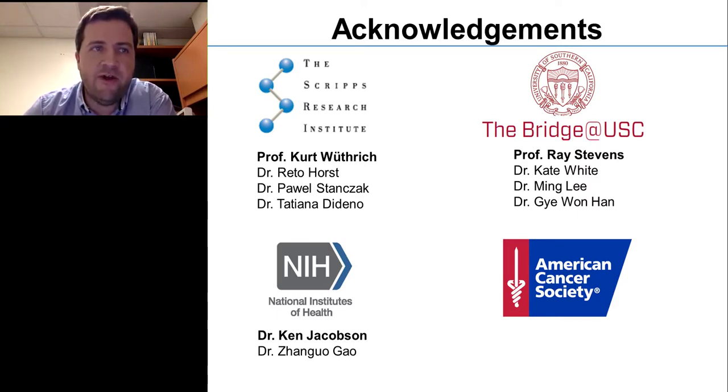Because we can now get site-specific structural information of a human GPCR, we're not limited in what we study to ligands of very high affinity, which are typically used for crystallization studies. In fact, we can look at ligands that have affinity as low as in the millimolar range. So we should be able to use this technique to get information about the conformation of the receptor in complex with ligands that haven't been co-crystallized.